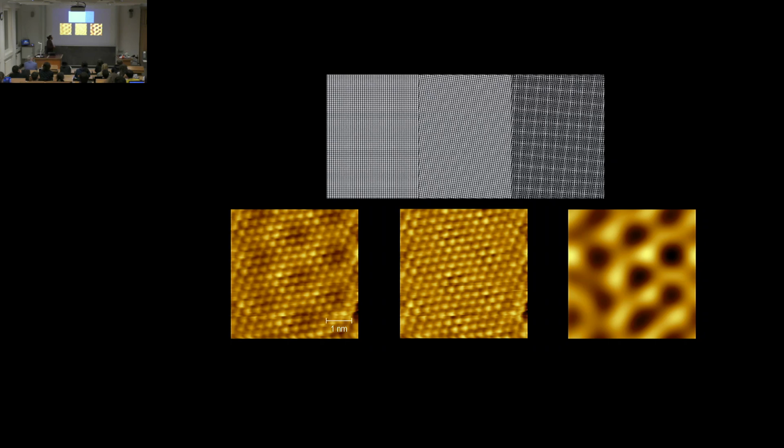So this is the type of images that you can make, but you have to keep in mind that this is not an image made by photons. This is just reconstructed using the tunnel effect. And you can also ask, can we measure other things using STM? And I will not answer this question, but Christoph will answer it. Thank you very much.